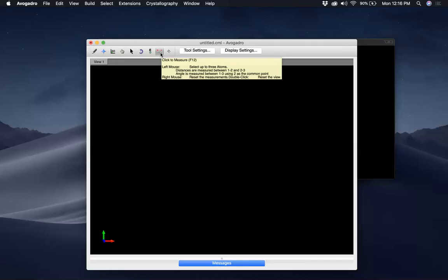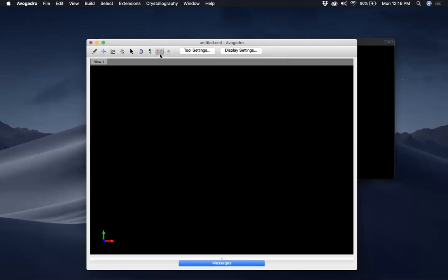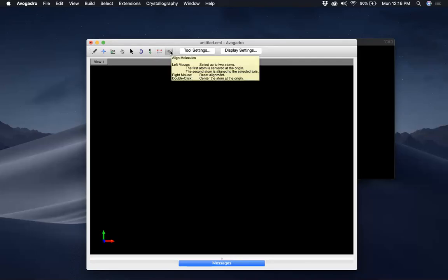What the Measurement Tool does is let you select two, three, or four atoms, and then you can get the bond lengths, bond angles, and dihedral angles when you have four atoms. So the Measurement Tool helps you measure things in the molecule. This is to align molecules — the parallel arrows icon is the Align Tool.